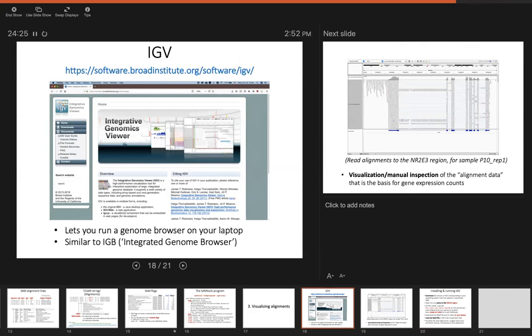And you can just go to the mouse genome, the MM10 genome, which is actually a genome from the Broad. You could also create a genome yourself from the FASTA and GTF files from Ensembl to have whichever specific version of the genome you want to use. But we're not going to do that. You're welcome to do it. I think it's the best way, but it's going to take more time.